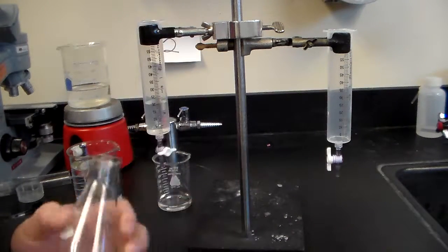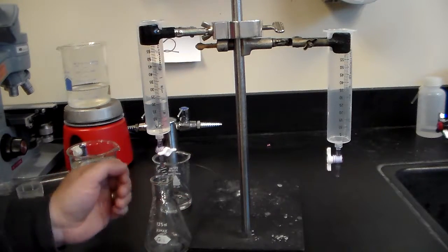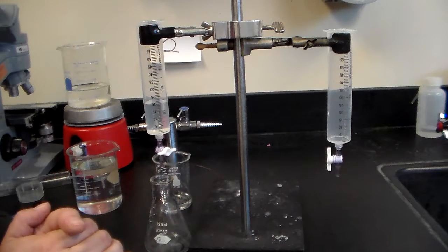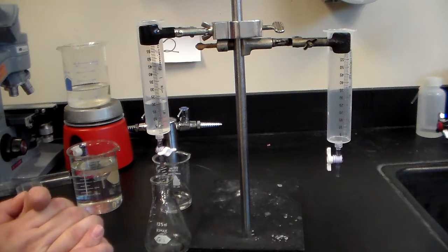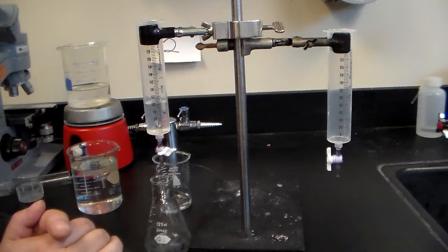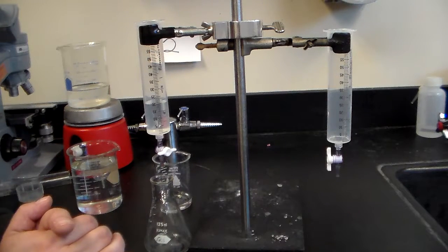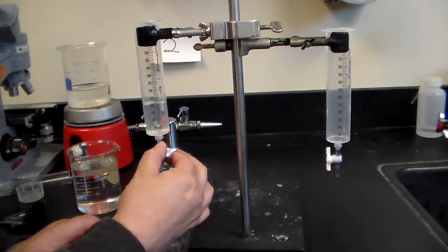You're going to put the flask underneath here and then you're going to release a certain amount of acid in there. Actually, I should say a certain amount of base, because the base is going to be our unknown in this experiment. We're going to know the concentration of our acid. We're going to set in a certain amount, let's say five milliliters.